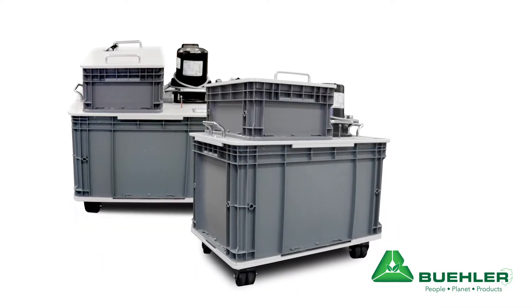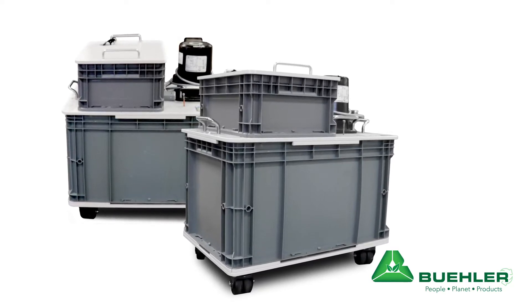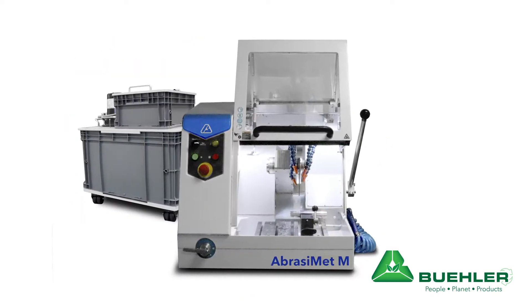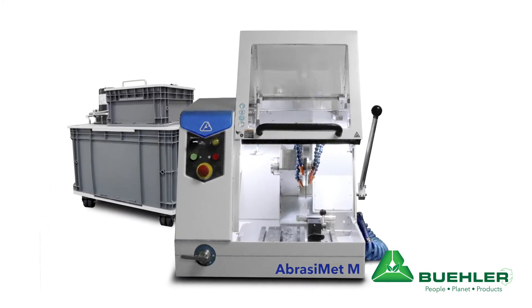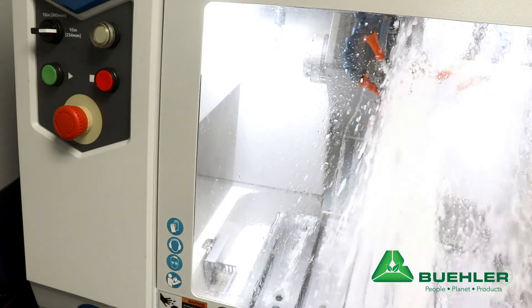First I'd like to share a recent innovation in our recirculation system for abrasive sectioning. With the launch of our 12 inch manual abrasive saw, the Abrasomat M, we identified a need for a compact solution for filtering and recirculating water and coolant.